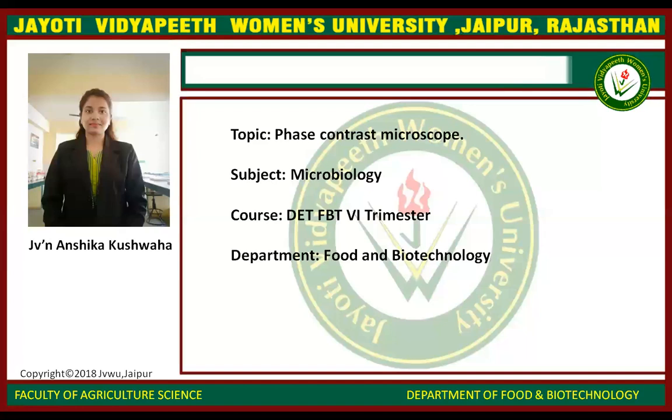So, what are the parts of phase contrast microscope? The phase contrast microscope is a special adaptation of light microscopy and helps to obtain a clear picture of living or unstained cells. The adapters convert minute differences in phase changes in transmitted light, due to refractive indices of all cell organelles, into perceptible shades of gray. So this allows organelles of living cells to become visible with fair contrast in them.